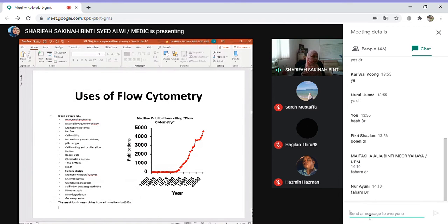Using this flow cytometer is very expensive. The antibody is expensive, the antigen is expensive, and the machine itself too. Certain labs charge around 10 to 20 ringgit per sample. Usually you don't use Flowcyto for just one sample; sometimes it can be dozens of samples. Imagine you have 10 samples: 10 times 20 is already 200, and that's just one replicate, not counting three replicates. If all three replicates are very fluctuating, you have to repeat it. So it is very costly.